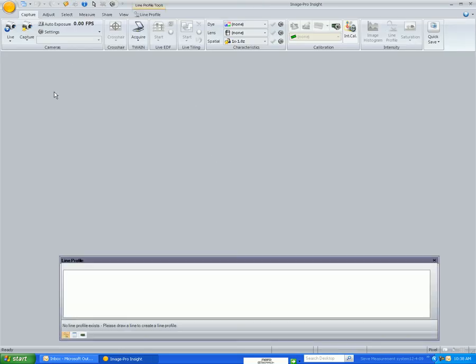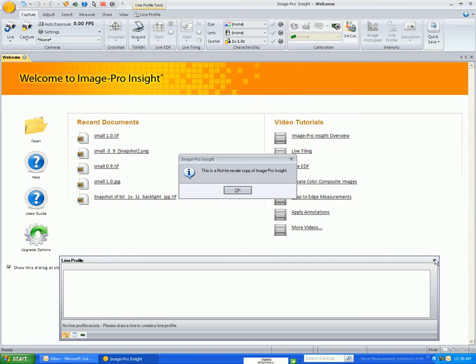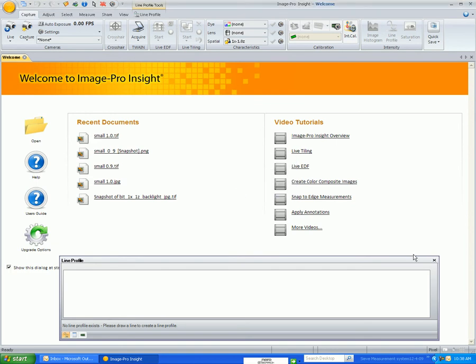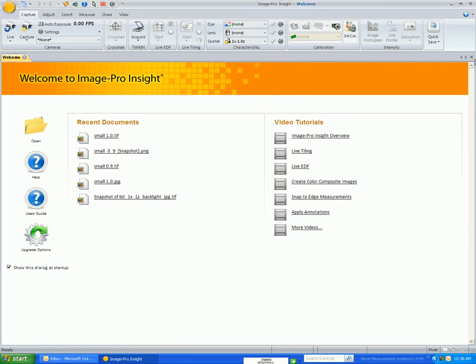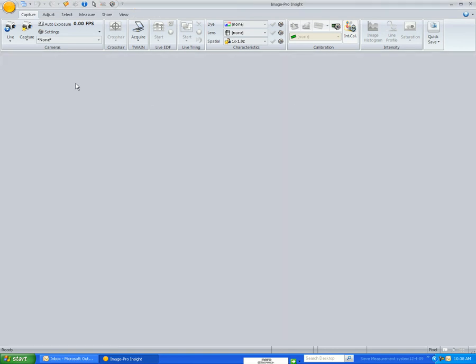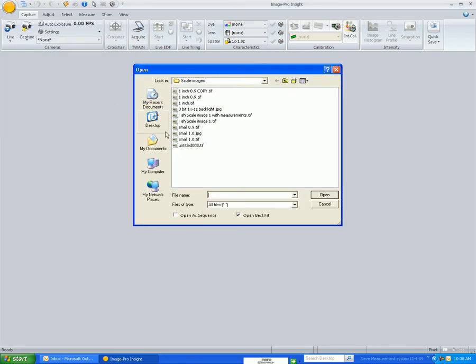We're now in the primary window for Insight. I'm going to close these windows that opened up and now I'm going to open up a scale image.